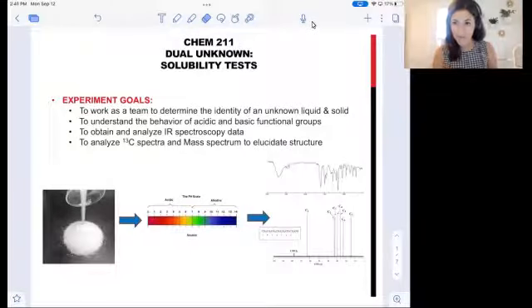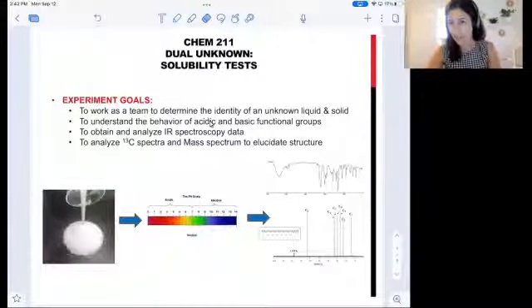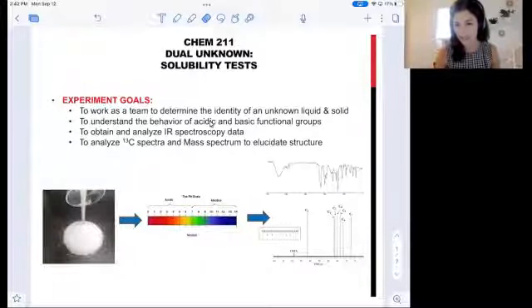Welcome to the pre-lab videos for experiments 3 and 4. In this video, we're going to focus on how we can learn about the acidic or basic functional groups present in our unknowns by studying the solubility of our compounds in aqueous solutions at various pHs.